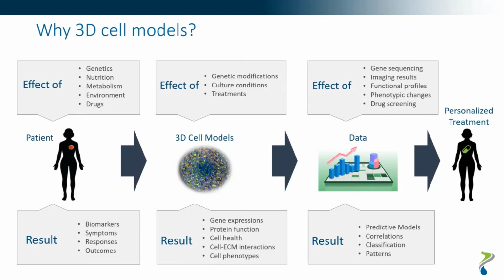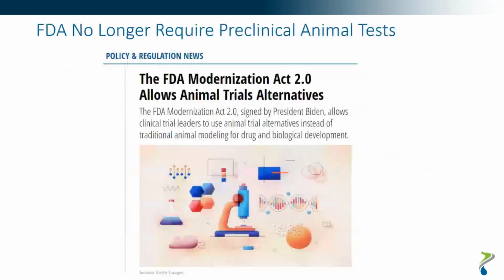And so ideally, we would like to have an in vitro model that would simulate these tissue-specific physiological and pathophysiological environments and responses, and would tell us what we would see in a real human body under similar conditions. And then using modern computational tools and the data that we obtain from these models, we can draw a more complete picture of disease progression and responses to different drugs, towards the goal to improve the drug discovery process and to provide fast and reliable information to clinicians so that they can select the best and the most appropriate treatment strategy for their patients.